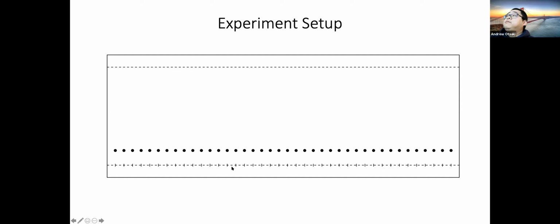mixture. You'll spot that, and then once it's developed, the solvent will run up this plate, and this line here is where the solvent will stop, and we'll take it out and draw a line across it, and that's called our solvent front. So that's how far the solvent traveled up the plate, and that will be useful for calculating RF values. Okay, so here are our tick marks where we label each of the amino acids or unknown, where it is on the plate, on the paper.